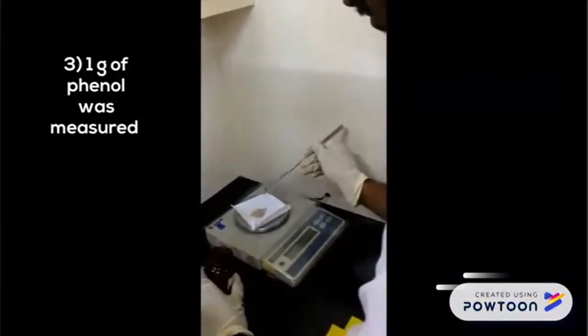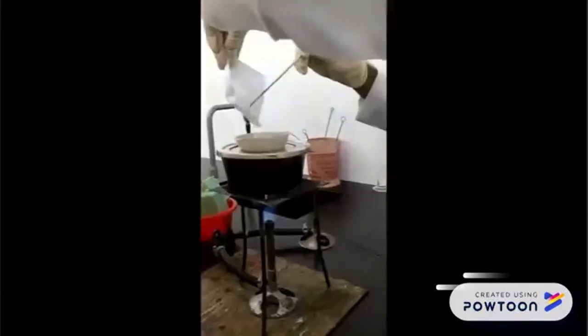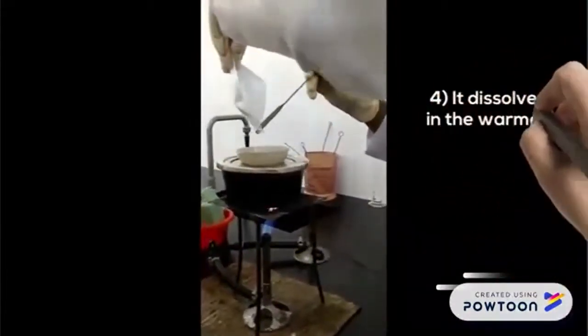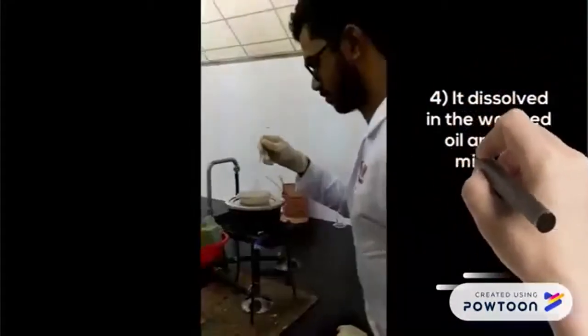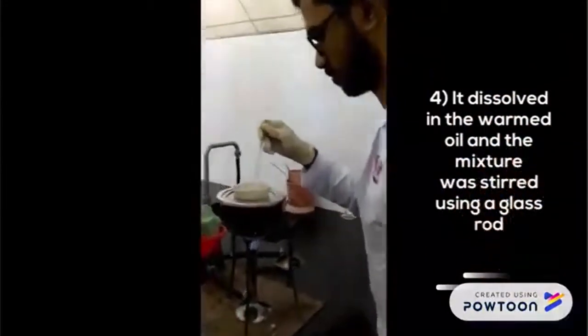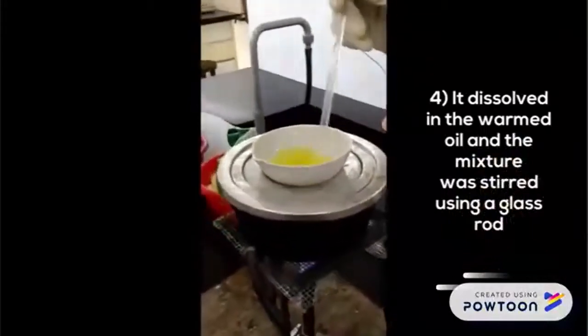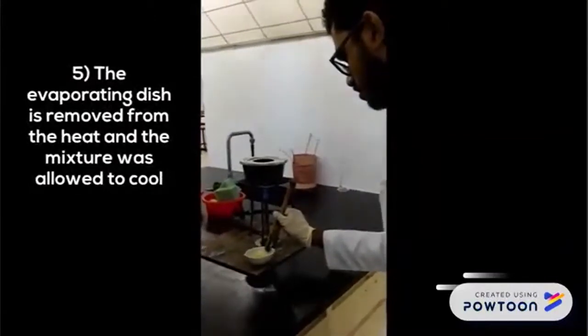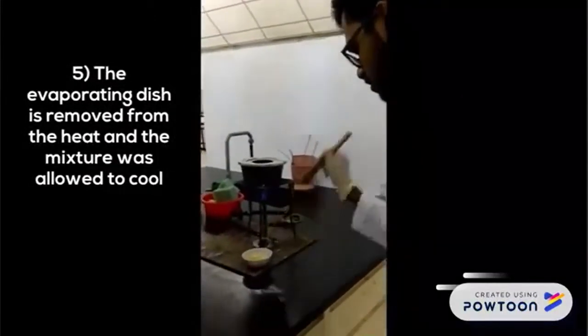Next, 1 gram of phenol was measured. It was dissolved in the warm oil, and the mixture was stirred using a glass rod. The evaporating dish was then removed from the heat, and the mixture was allowed to cool.